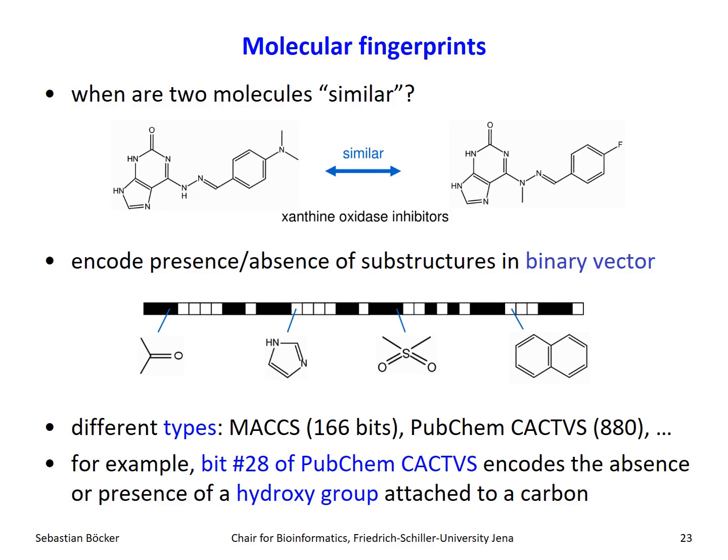But initially, these molecular fingerprints were, as far as I know, first used by Morgan, the Morgan fingerprints in 1965. And they were back then used to check whether a structure which you wanted to add to a structure database was already contained in the structure database. Okay? Again, no mass spectrometry connection whatsoever. And then they have been used for at least 2 decades in virtual screening. And there you want to, as I said, decide if two molecular structures are similar. And how do you do that?